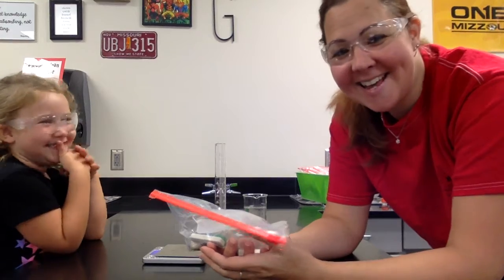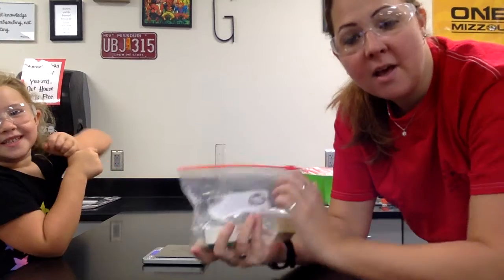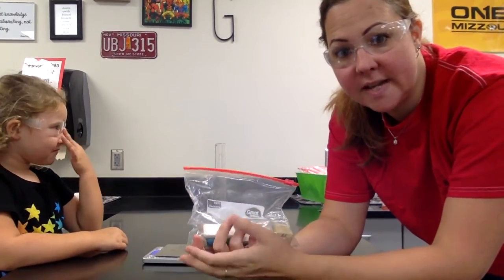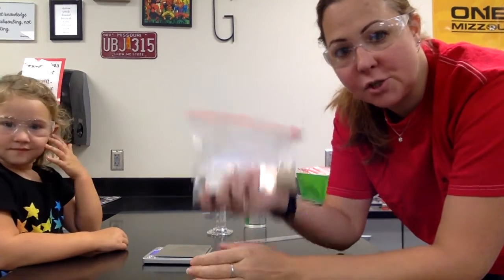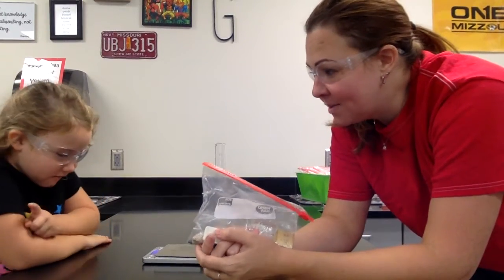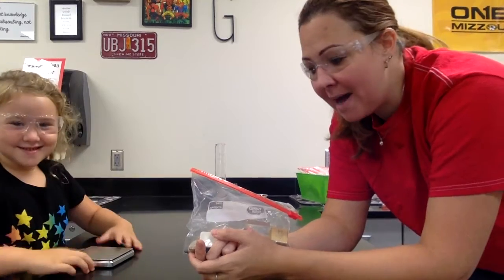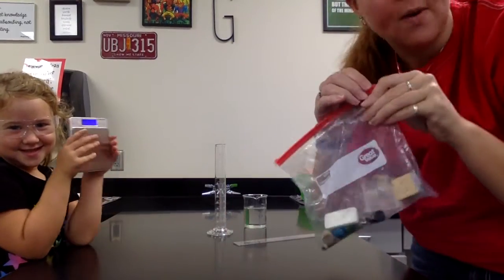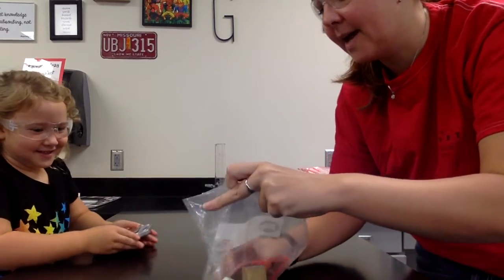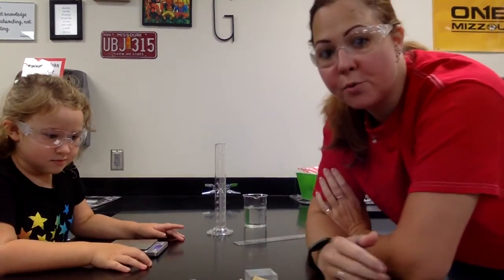In the lab today, you're just going to see two of the little objects that are in the bag. On your lab paper, you have the data for all of them. So you'll have to do the density for all of the objects, even though I'm just going to show you two. This is my lab partner here, Lillian. She's going to help me out with some measuring and things like that. But your objects that you have in your bag today, you have 9 of them.